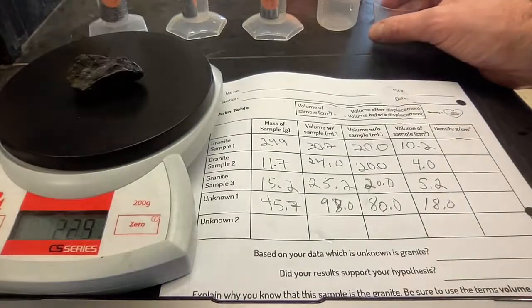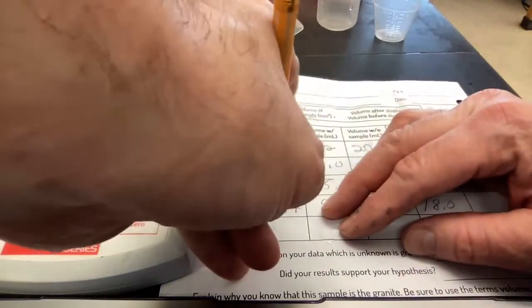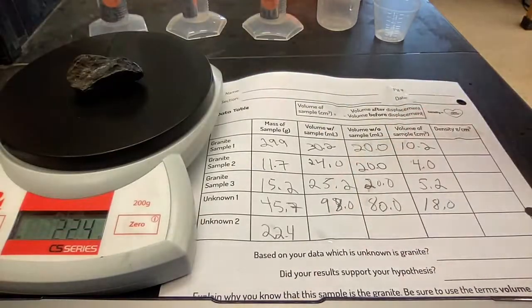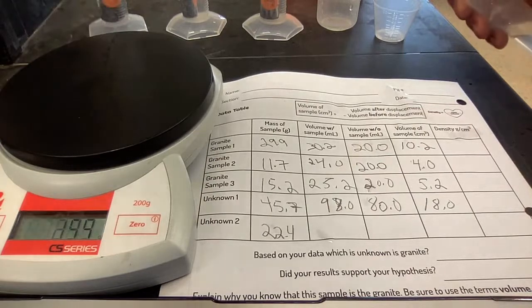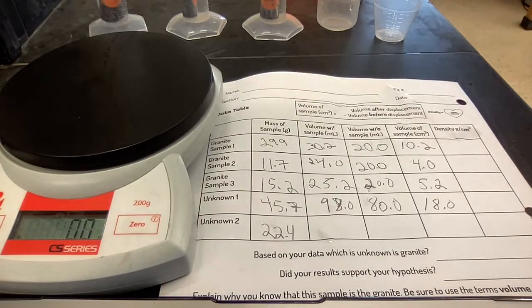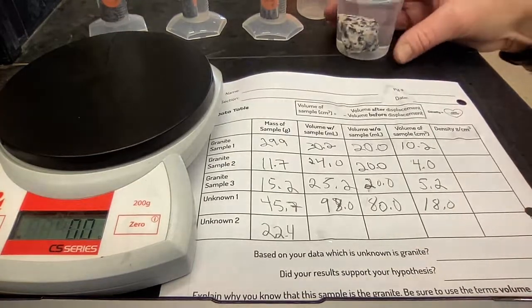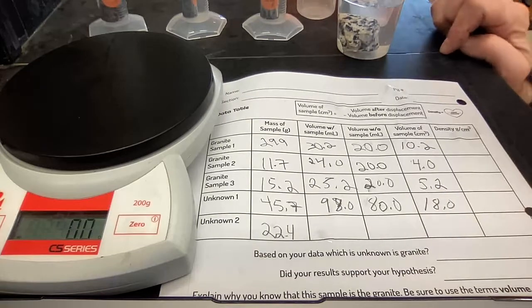unknown 2, the mass of which is 22.4 grams. And the volume of which, when submerged in what I already measured out to be 20 milliliters of water. So I'm going to have to pull an audible here. I have this known combined volume of 98 milliliters.